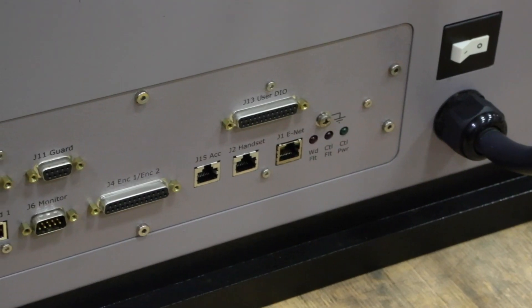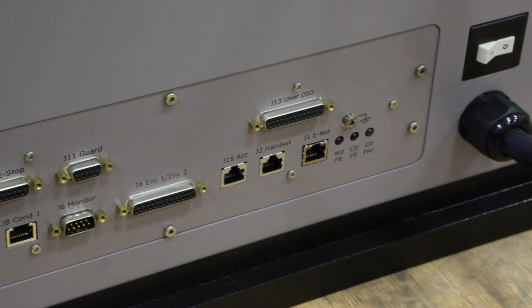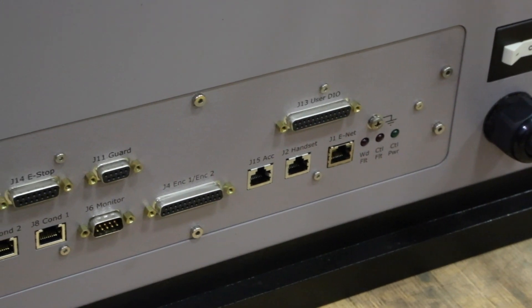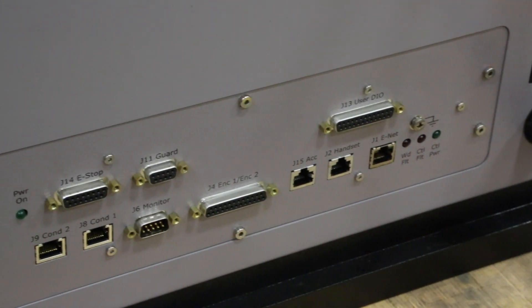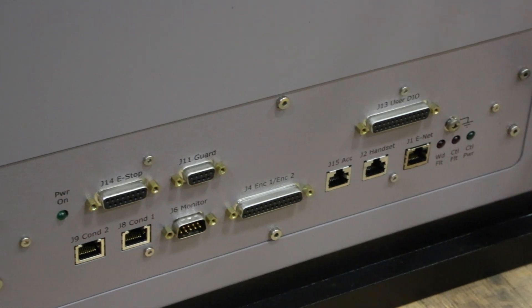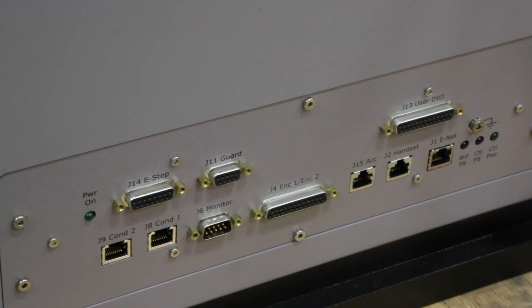The controller's analog, digital, and encoder inputs accommodate a multitude of sensors from MTS and others. And its analog outputs can send data to more complex systems like DIC.